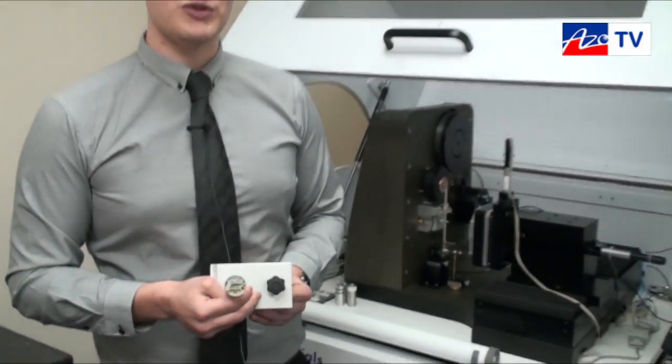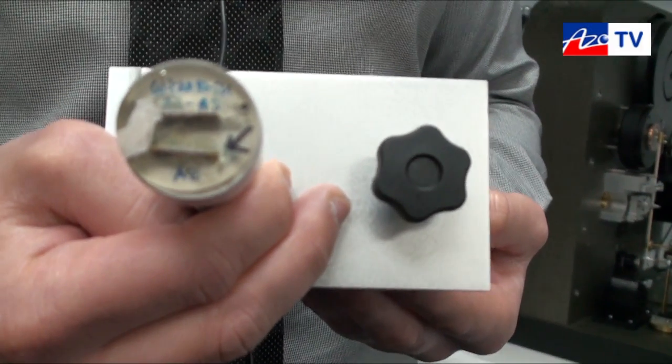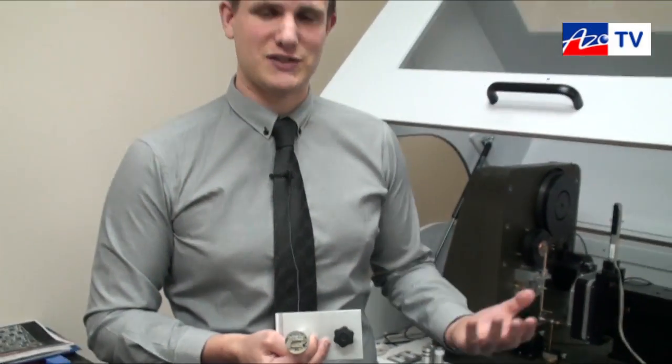This is the kind of sample that we typically work with. This is a cross-section of a solder on a copper sample. What we want to do is look at the properties of the inter-metallic layer in the cross-section.